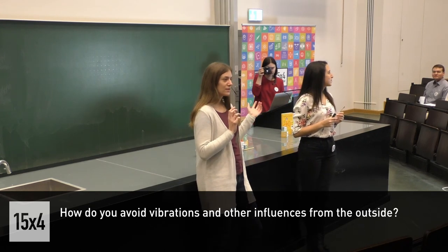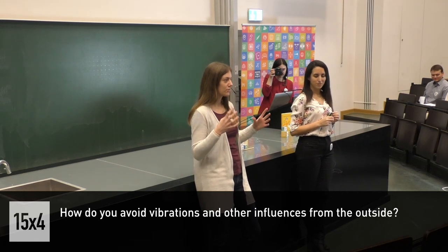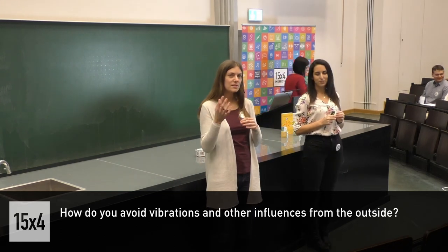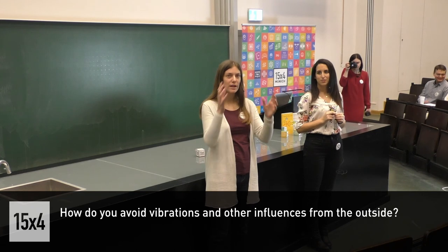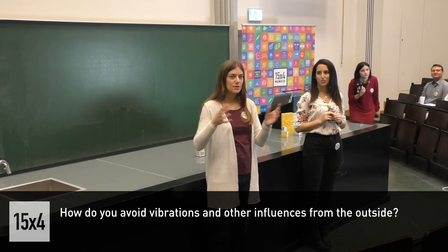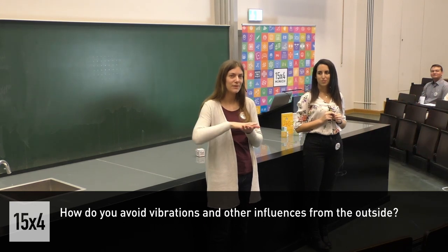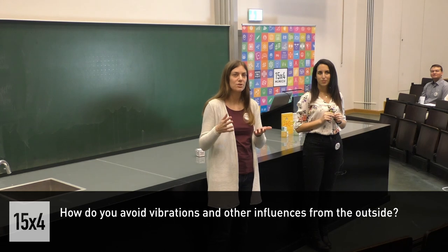Part of it is what you've seen, this big apparatus with this big chamber. It really protects us a lot. This is mostly the protection from gas molecules from the air, because our air is actually so dense that a clean surface will completely oxidize very quickly. We couldn't even measure one image.